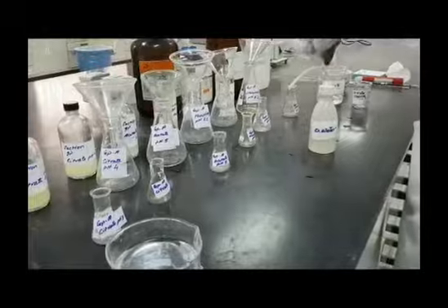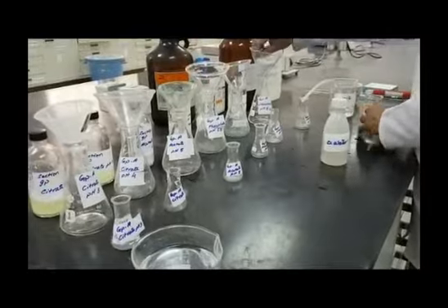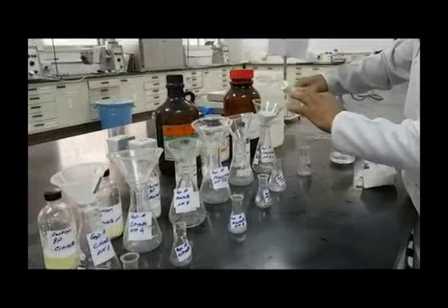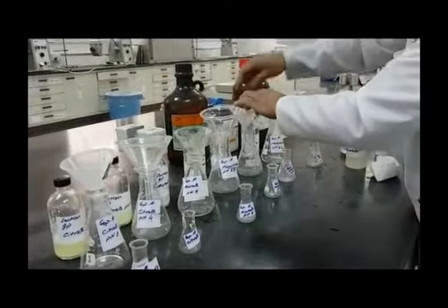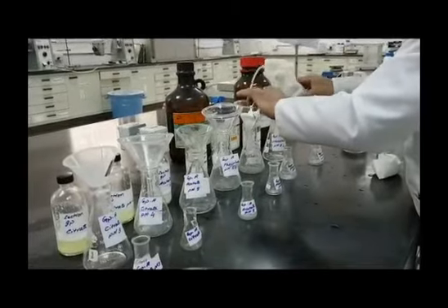Fold the filter papers and place them in the funnel. Then do the wetting step using distilled water. Do the same for all of the 6 filtration assemblies. 3 to 4 drops of distilled water are enough to wet the filter paper.